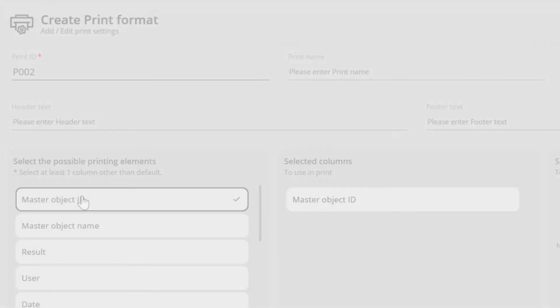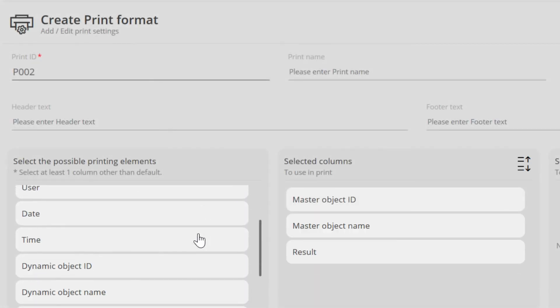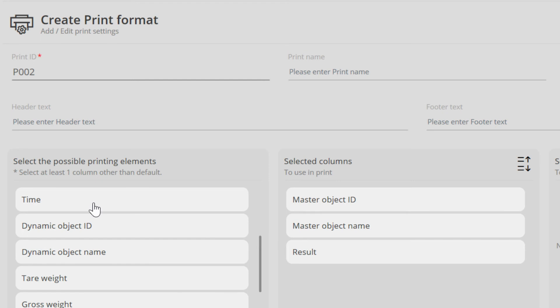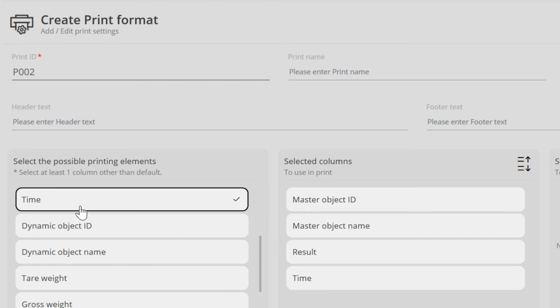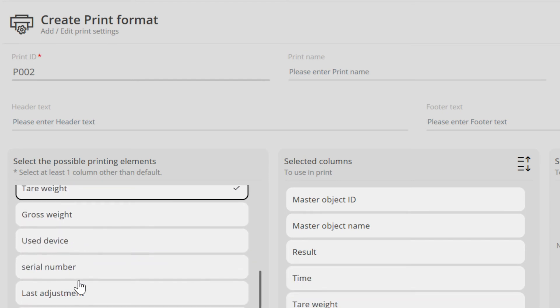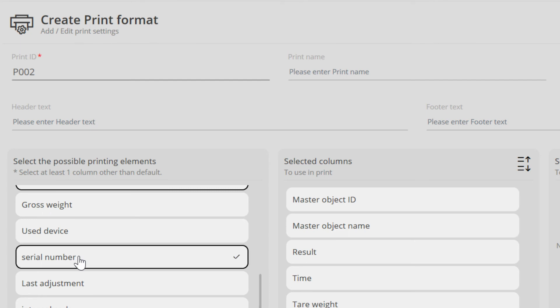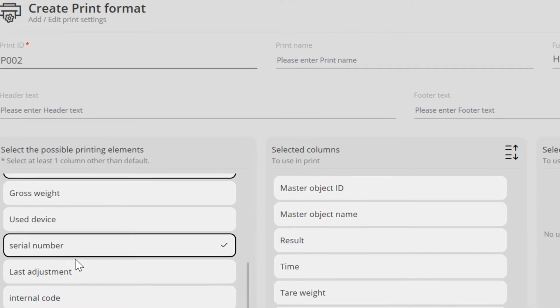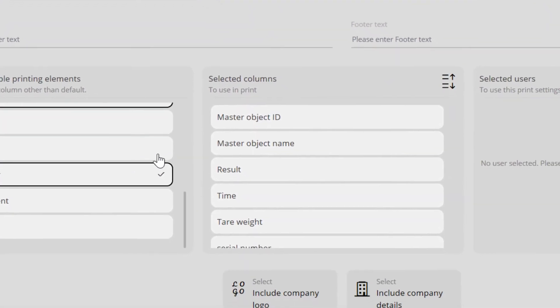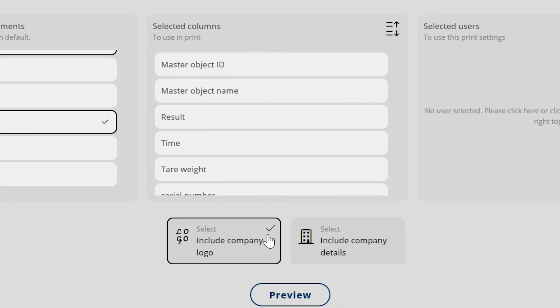The user can decide which data fields are printed. In the settings, the user can decide whether unstable weighing values may be stored and printed or not. The printout can be displayed with the address and logo of the user.